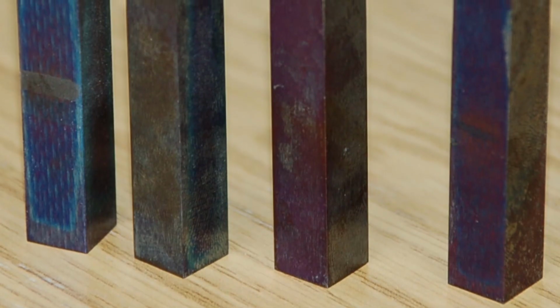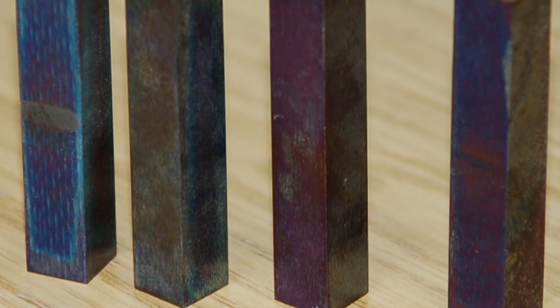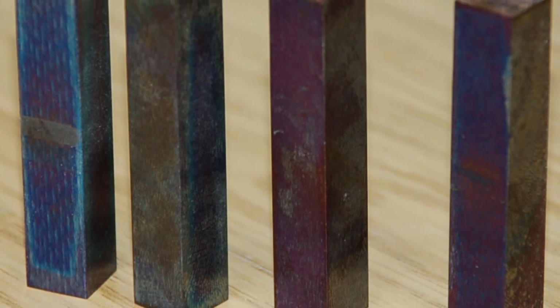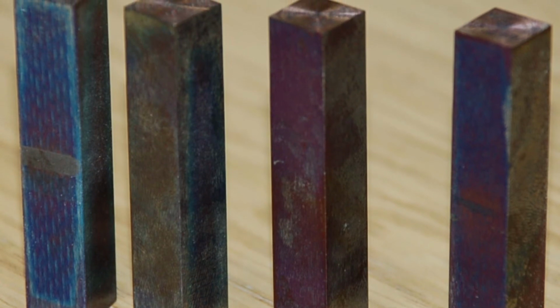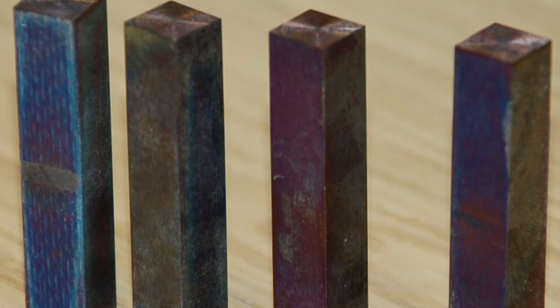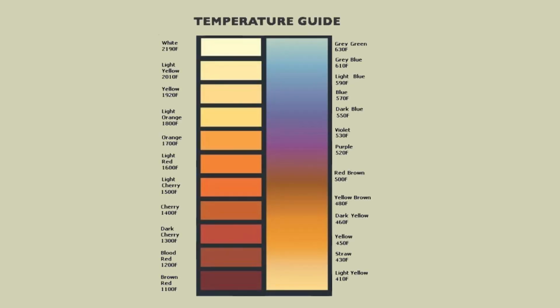The colors formed are similar to temper colors and are created by a light interference effect. Optical path length differences are the cause of this effect, as light is reflected between the oxide metal interface and the surface of the oxide film, resulting in a characteristic array of heat tint colors. Typically, the color of heat tint can be compared with charts to develop a rough thermal history of the metal, but because these colors vary in shade depending on the thickness of the oxide layer, it is theoretically possible to crudely estimate the thickness of the film as well.